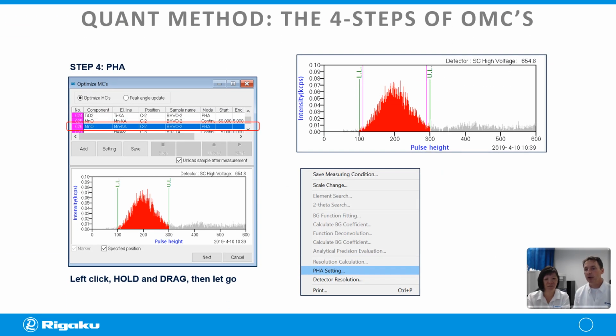All right, and then the last step here, without getting into any detail, and this is actually a very easy step, is essentially our detector window. If you do chromatography and you use a photodiode array detector, you're picking what wavelength you want to use. It's not the same as that, but it can be thought of in a similar way, as picking my energy window, what I want it to allow in. So if I have a higher energy, second order radiation coming through, in other words, half the wavelength of the element that I'm looking for, well, that's of higher energy, so I can exclude that information at the detector.